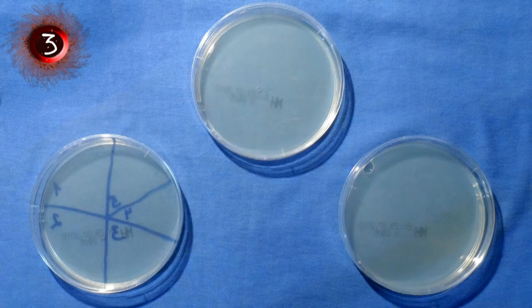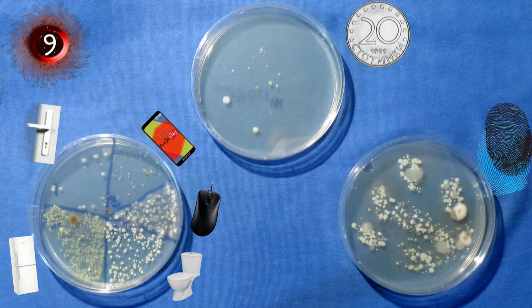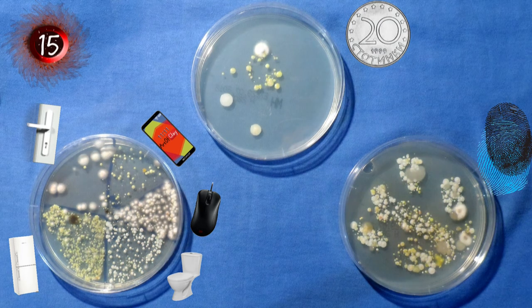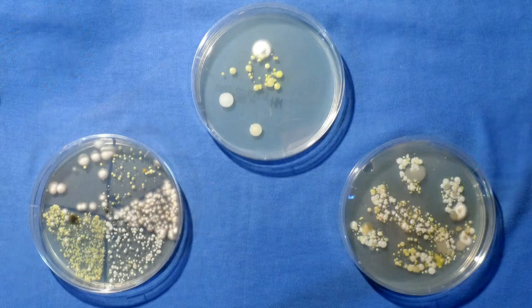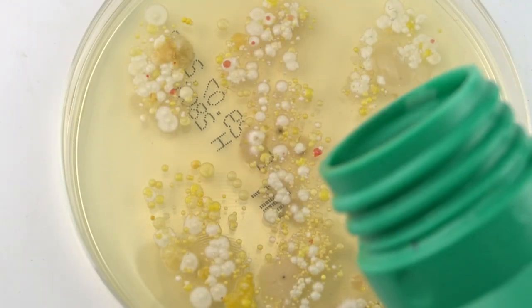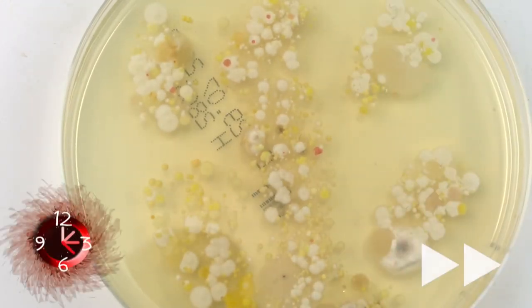Here you can see all of them again. It turned out to be a very interesting experiment. Now let's kill the colonies. Before disposing of the Petri dish, pour bleach over it and wait for the bacteria to die.